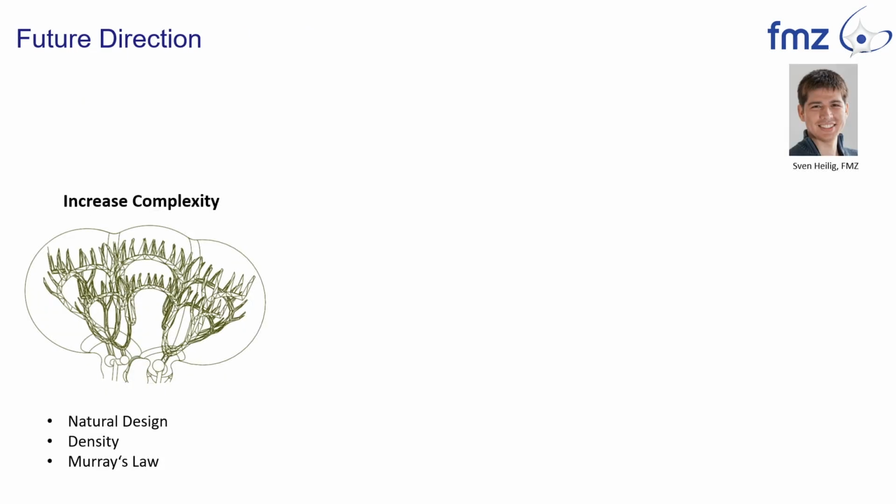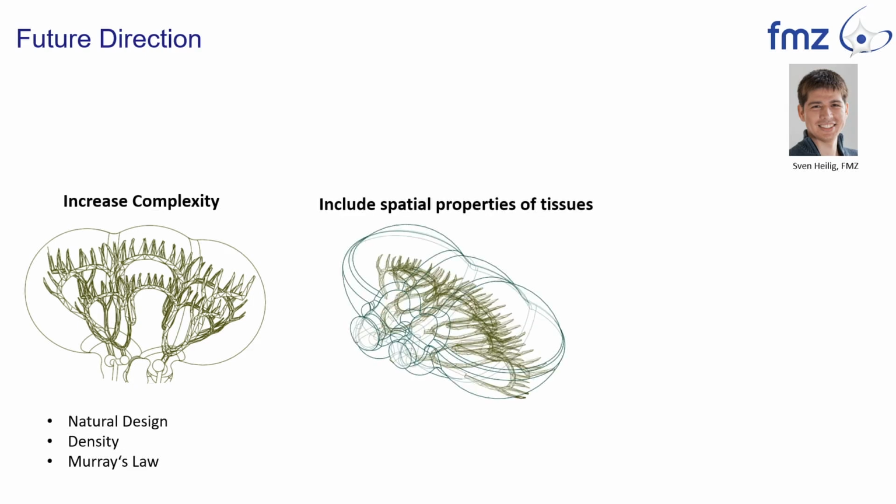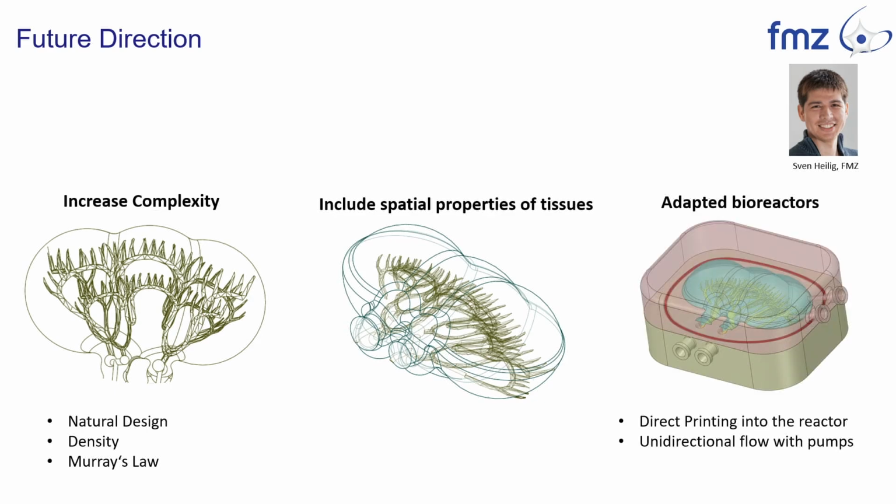For the future direction of this project, we want to increase the complexity of the networks, as I said before. We want to test how dense we can go with these printed fibers. And we also want to include Murray's law, which basically means that the mother vessel is bigger than the daughter vessel in a specific ratio. We also want to include the spatial properties of the tissue for the hydrogel by generating adapted bioreactors. And the idea is also to print directly into the bioreactors, which would not be possible with melt electrowriting, but with this technology it is possible. And we want to achieve a unidirectional flow with pumps.